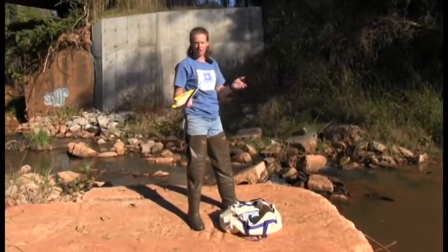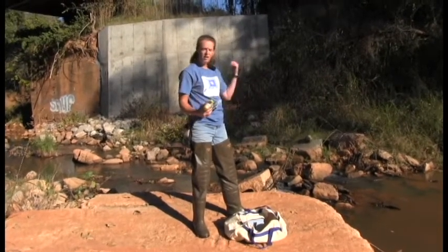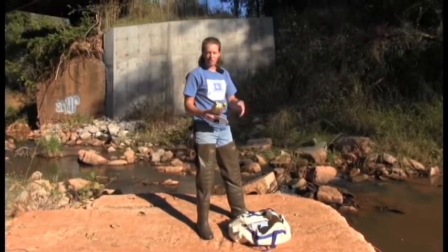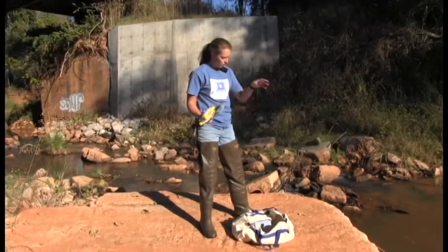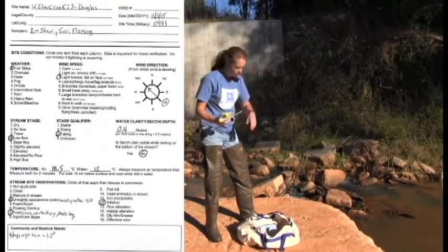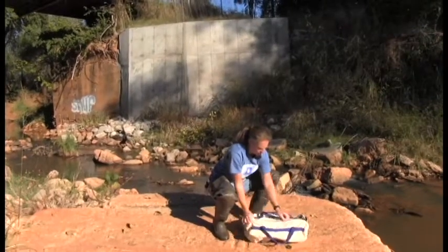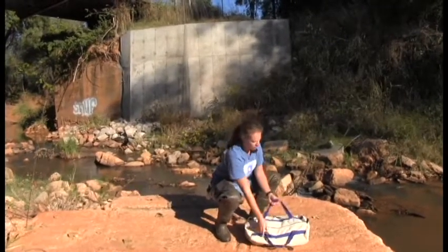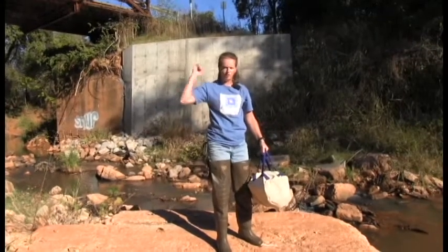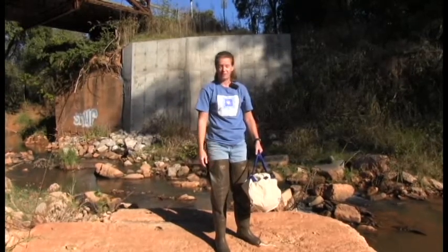We've done our dissolved oxygen collections on our sample water bottle, filled those on the upstream side of our riffle. We got our air temperature first, then water temperature second, and filled out our data sheet. We just did our secchi depth reading, so now we're ready to pack up everything. We have monitored West Elm Creek for the day and we're ready to go back to our vehicle, go back indoors to do the rest of our testing. We've had a great day in the field today.